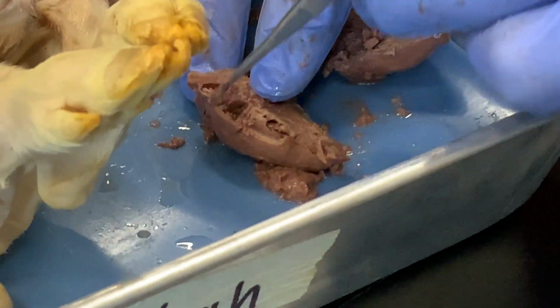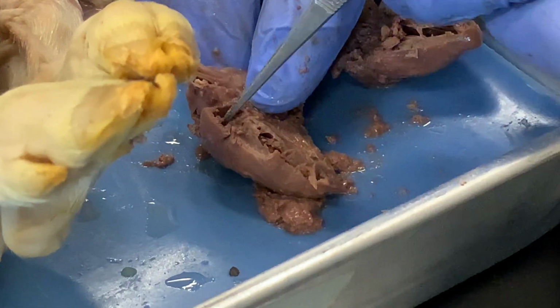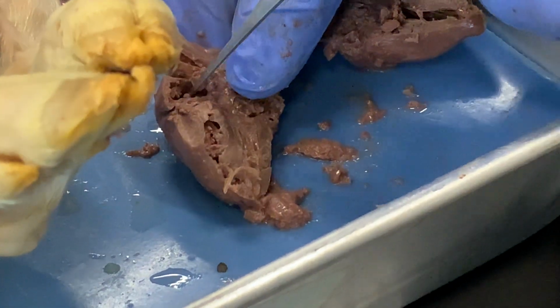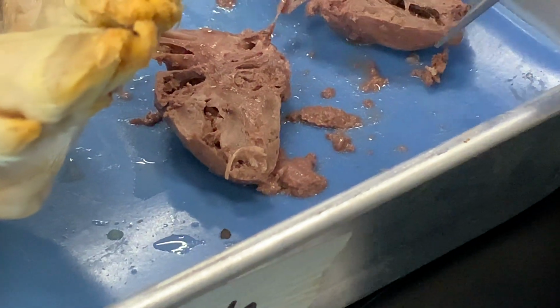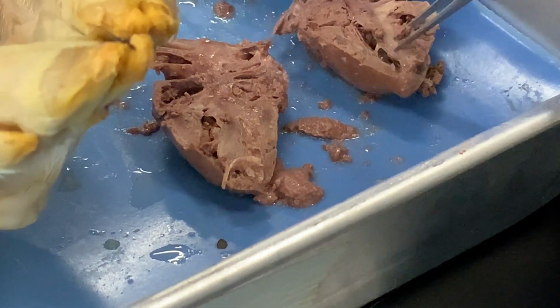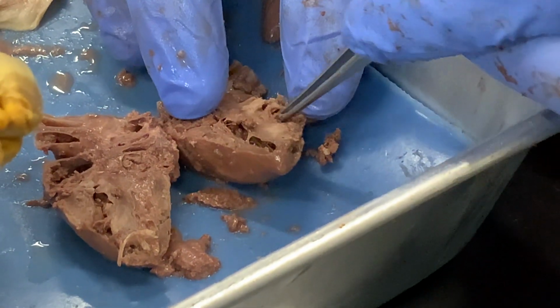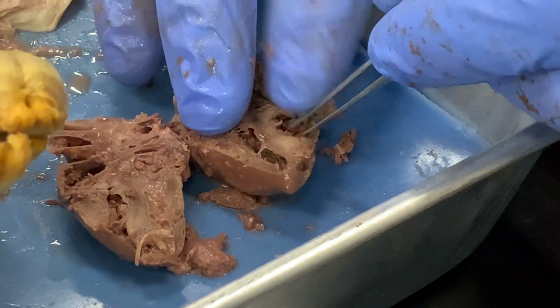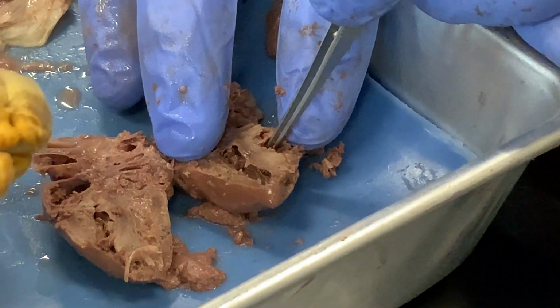This is called the vena cava. Blood drains through that and into the right atrium. It passes through a valve that is somewhat hidden in the tissues here, into this chamber right here, which is the right ventricle.